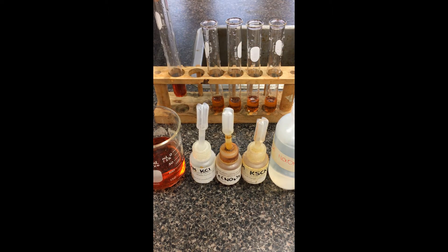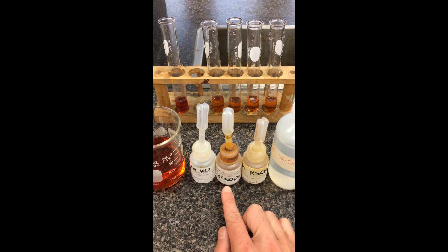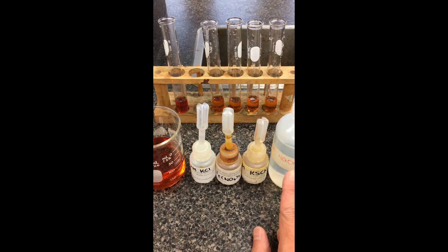Test tube A is going to serve as a control. We're going to be shifting B through E and comparing how the color has changed. The stress ions we're adding involve KCl, Fe(NO₃)₃, KSCN, and 6 molar NaOH. The exact number of drops doesn't matter, but approximately twenty drops is about a milliliter.